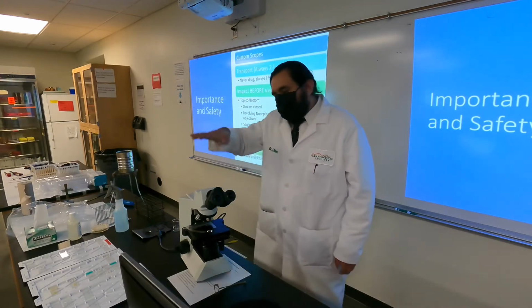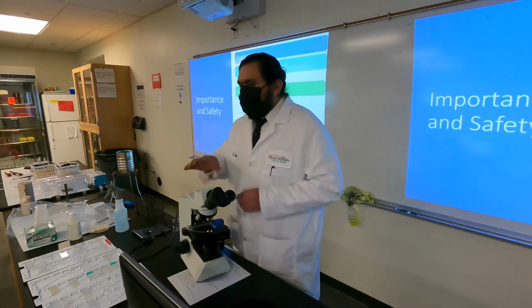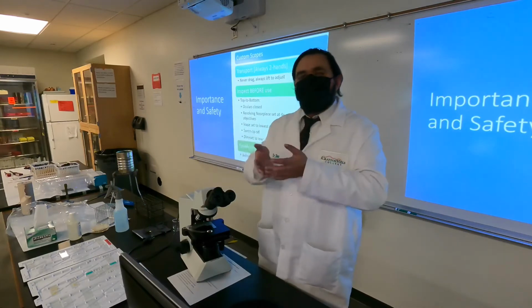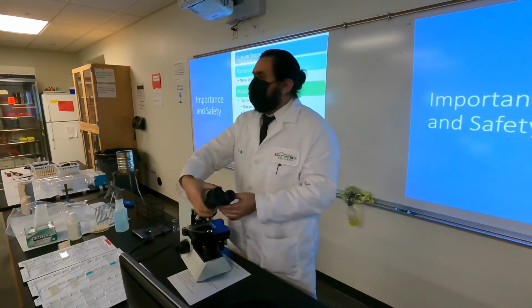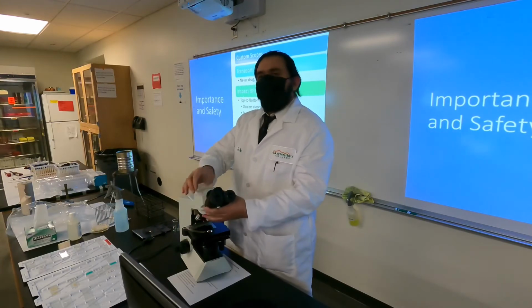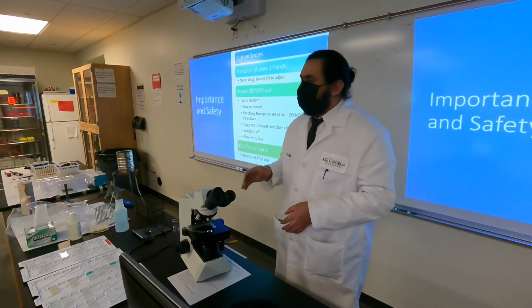But the idea is you do a quick top to bottom inspection. Let me move this guy around. You always look at the oculars. The oculars should always be put in a closed position so they look like a little inverted V. And so these guys adjust a lot, but you're gonna want them to be closed. Again, let them be so that you can find out who didn't do them right.